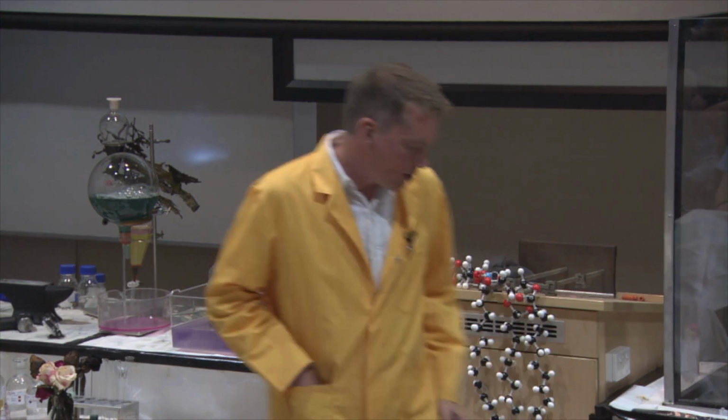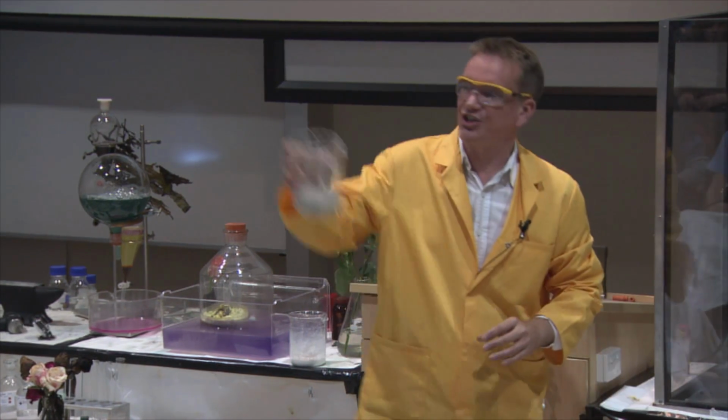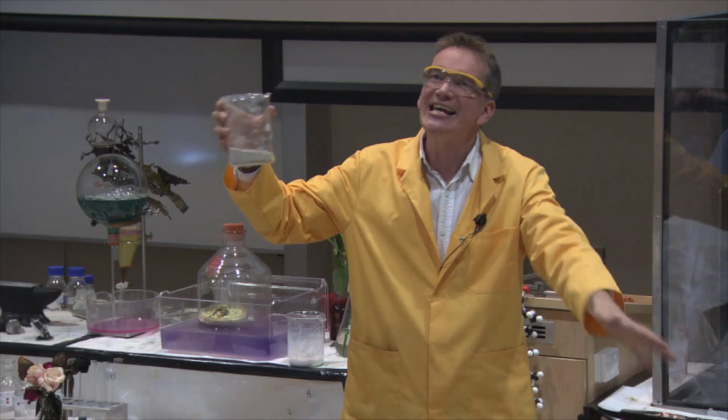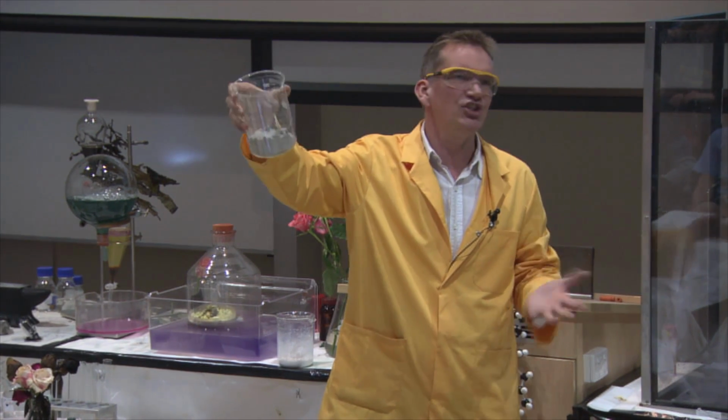But I've used another chemical though. I've used potassium carbonate. So where do I get that from? Well, I can get that from ash, from wood ash. And this is what I've got here. So if you completely burn up the wood, the charcoal, you're left with this solid residue. This is just wood ash.